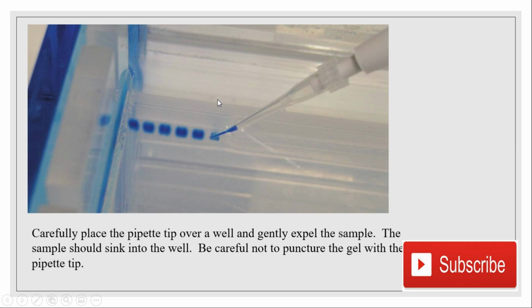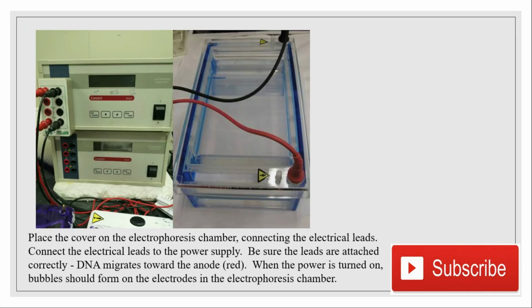If you are using it from the upward side, from this side, there might be a chance some sample moves out and transfers into this well. It will contaminate the sample and affect the quality of the gel. Also be careful not to puncture the gel with the pipette.